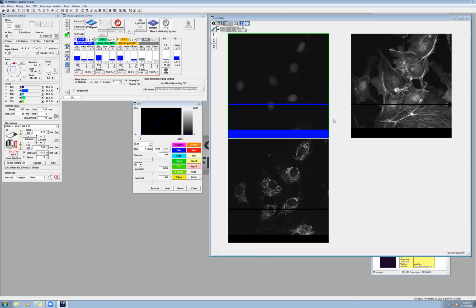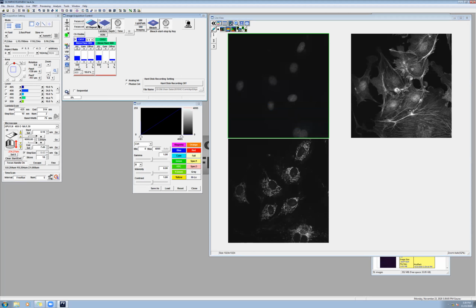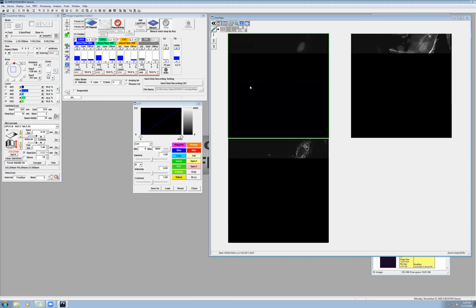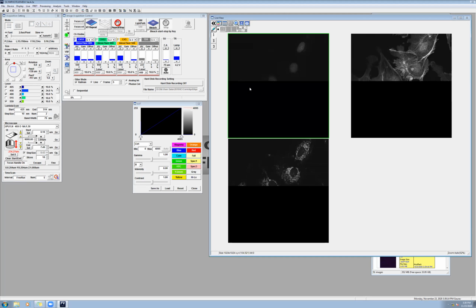I guess I did not like when I was changing things, so let it get imaged once more. Oh, it was fine. All right, so it's imaging everything once more.